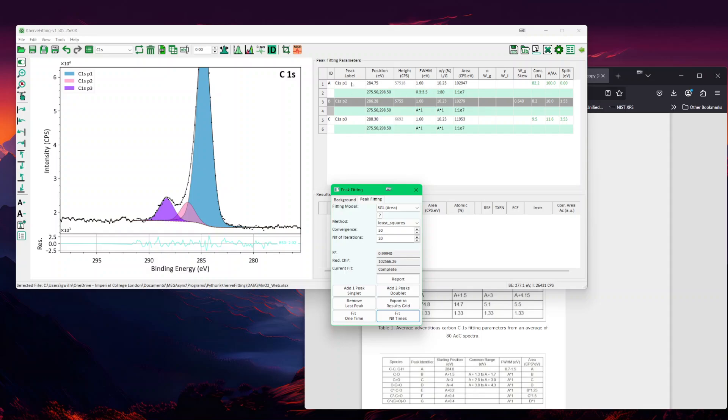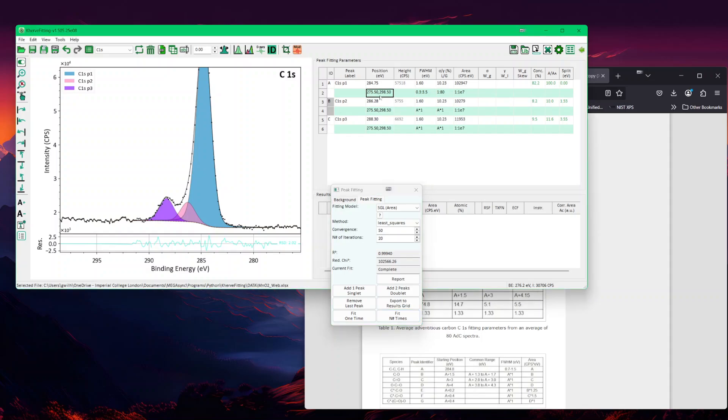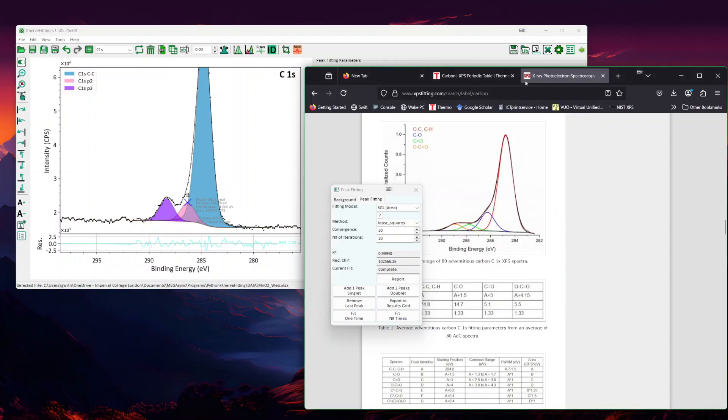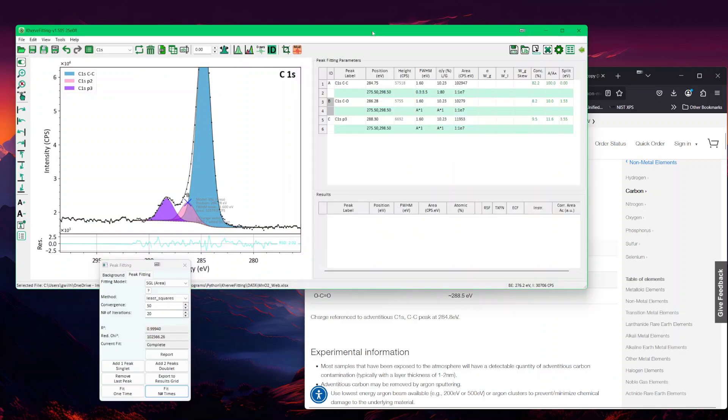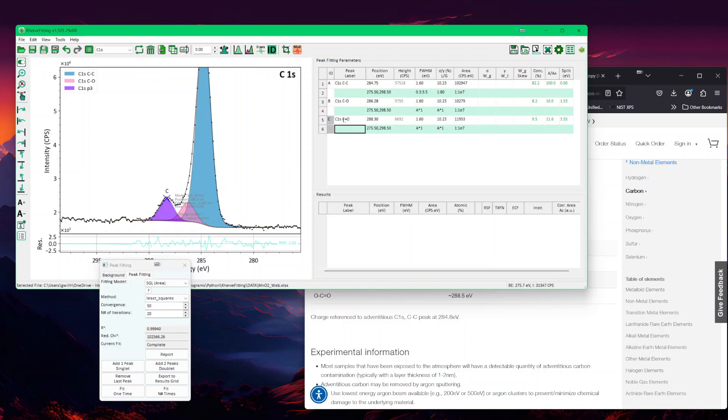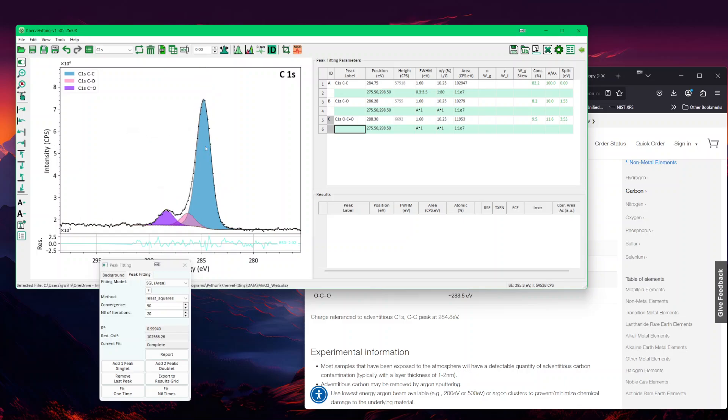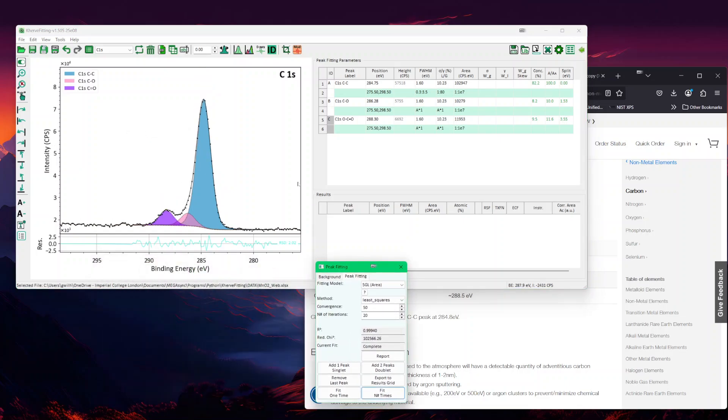Now I would assume that there are only three peaks. I would now name the peaks to C-C, C-O. Just like the peak library, you can call it COC, I call it C-O. Then this one would be more a C double bond or even the O-C double bond. This would be how you fit carbon 1S.